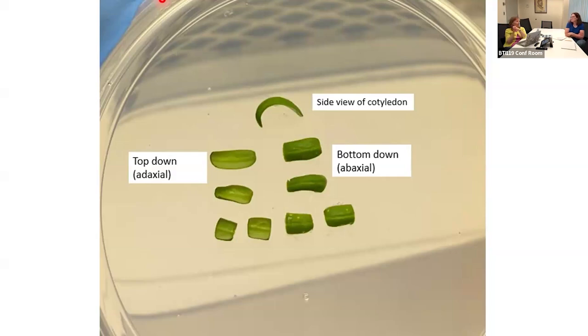One caveat is that you have to keep an eye on your medium. We transfer our material to new, freshly prepared medium every 2 weeks, so we don't have to worry about the medium dehydrating. We use micropore tape on everything, except, as Carrie mentioned, the incubation co-cultivation period, where we use parafilm.